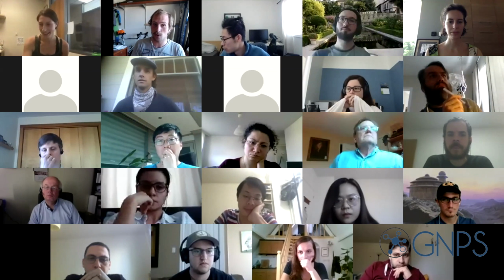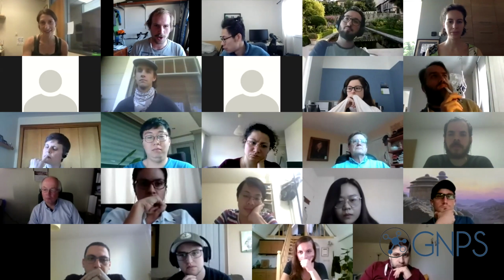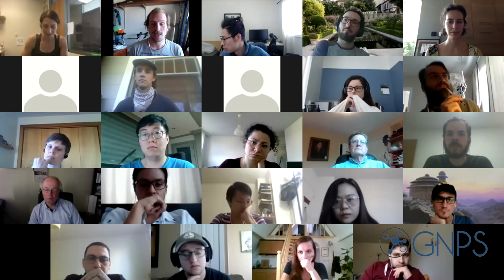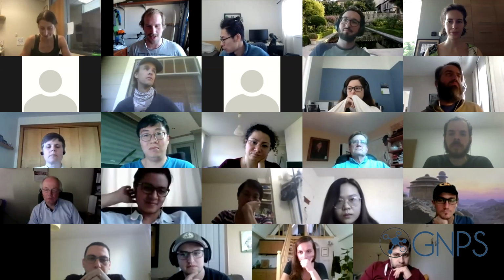So there's a bunch of tools that we now interface that might be introduced in future workshops in the next couple of weeks, and that leverage that information. So yeah, I hope you got excited about it. I hope you have all these networks in front of you now, and we can explore a little bit the chemical space of E. coli and Nissl.